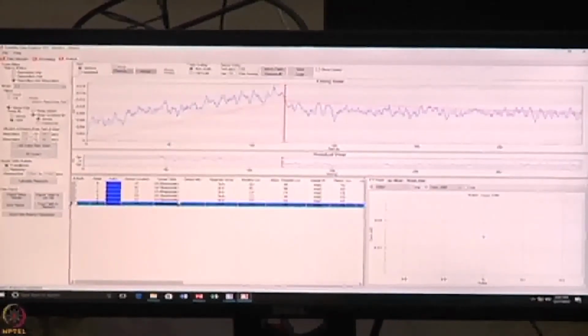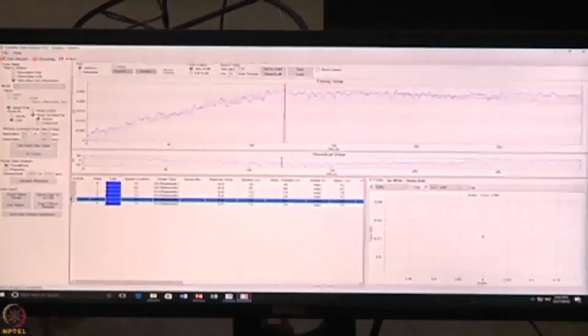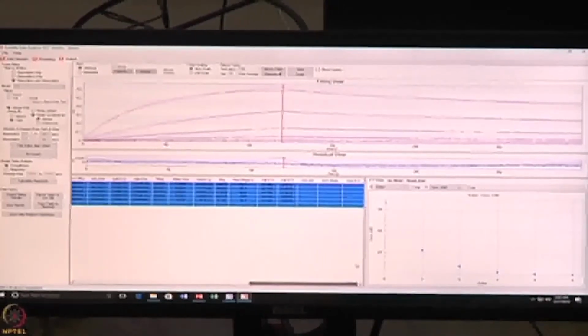Just if I uncheck it, this is okay. Next, with one concentration excluded, I can still do the fitting. KD has not changed much, but R square has changed somewhat. So then what I will do is save the report.